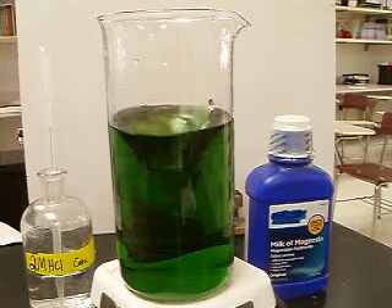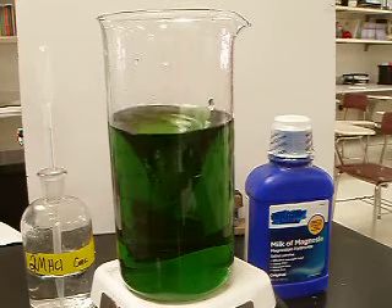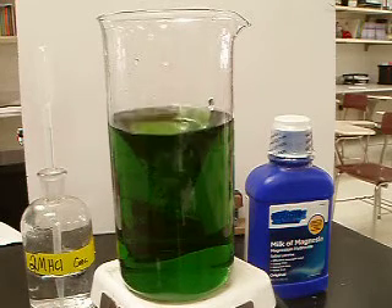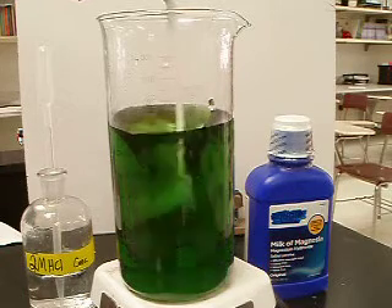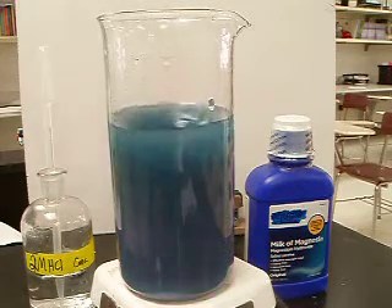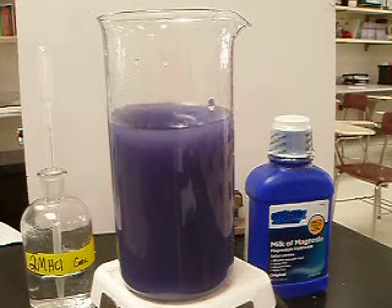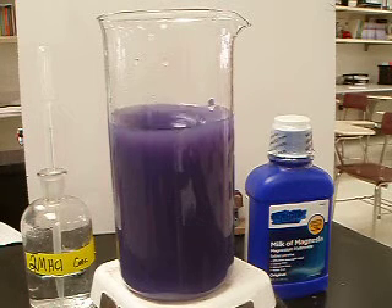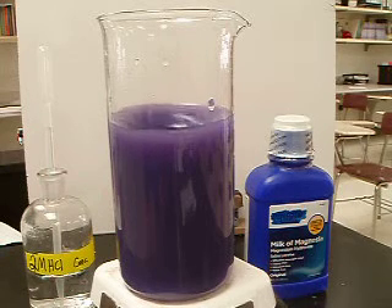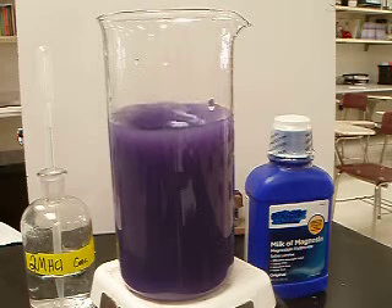What we're going to add right now is magnesium hydroxide — milk of magnesia. As we know, magnesium hydroxide is a base because it has hydroxide ions in it. So the very first thing we're going to notice is that this is going to change color from blue into purple as the hydroxide ions dissolve and dissociate into solution. They don't actually do anything to the indicator until they dissociate.